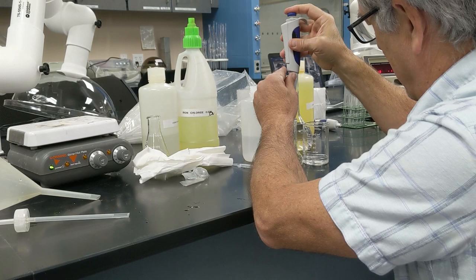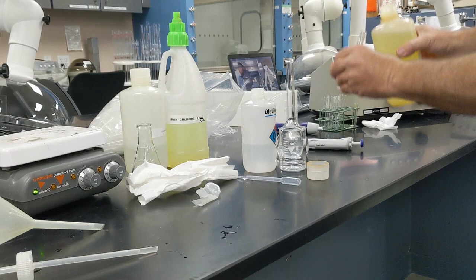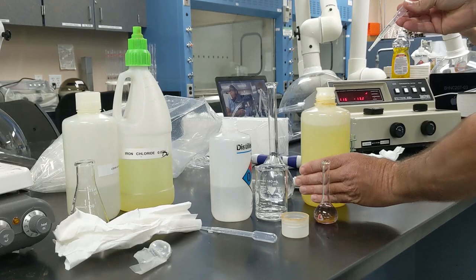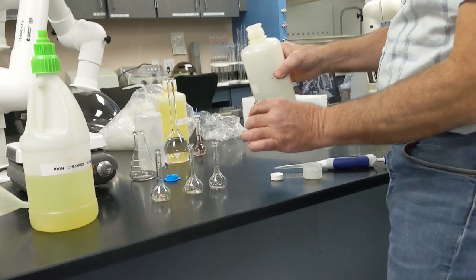And then the last part is to react the hydrolyzed aspirin with some iron chloride. So I'm going to pour the iron chloride into here now, and this should form a nice purple complex. So this is the sample now that's going to be ready for analysis. Okay. All right, so this is the preparation of the standards.